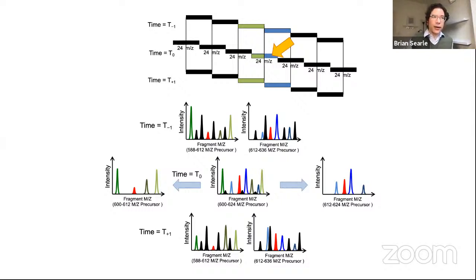But there are other interesting ways in which you would want to think about this from a TOF perspective. So David Schmidt brings up a really interesting point about what about scanning SWATH methods? That's where you take the quadrupole and you scan it across time. And actually, Waters came up with the first implementation of this called SONAR. So SONAR came out a couple of years before scanning SWATH. They're essentially the same type of approach where you're scanning the quadrupole over a specific window and you're acquiring micro scans at each of those different windows, and you can use linear algebra to deconvolute those together.